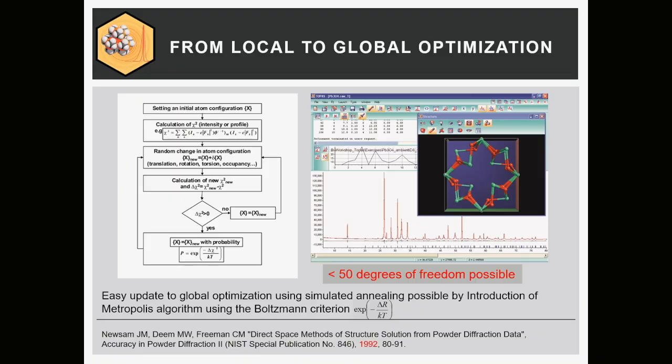Okay, coming to structure determination, and we can keep this pretty short. Do we have a few minutes? 8 minutes, wonderful. Because there's absolutely no reason in this world why we should do local minimization except for computing power. Okay? If we could, we would do all refinements in a global way.